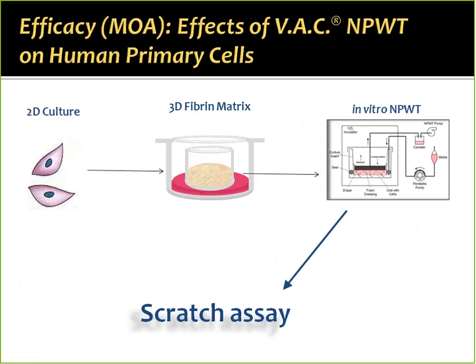Whenever we are designing new products, we want to make sure that whatever new materials we're considering for our products are going to be biocompatible, that they're going to be safe to use on human skin. So I'm going to focus the talk on those two different aspects. First, on how we test some of our mechanisms of action using negative pressure in vitro, and then later a little bit more on how we test biocompatibility using the xCELLigence.